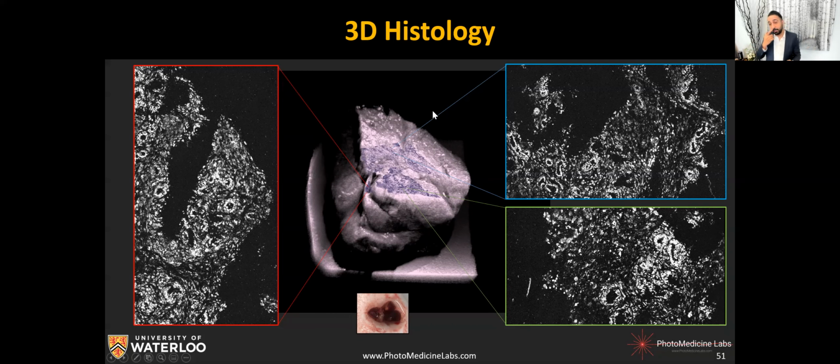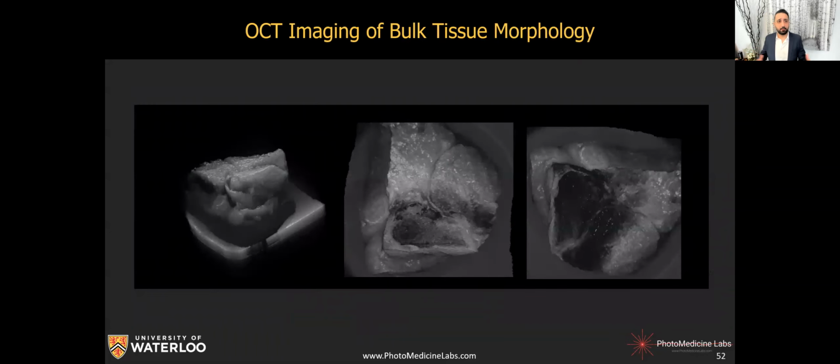So this is actually tumors in a rat, on resected fresh tissue. And for the first time, we can actually see very relevant information that our pathologists and our clinicians approve, that this is exactly the information they were hoping to see from a tumor in resected rat breast tissue. As I mentioned, this OCT work, to be able to look at different morphology of the tissue, is in progress. We're really pushing this to a very different level.